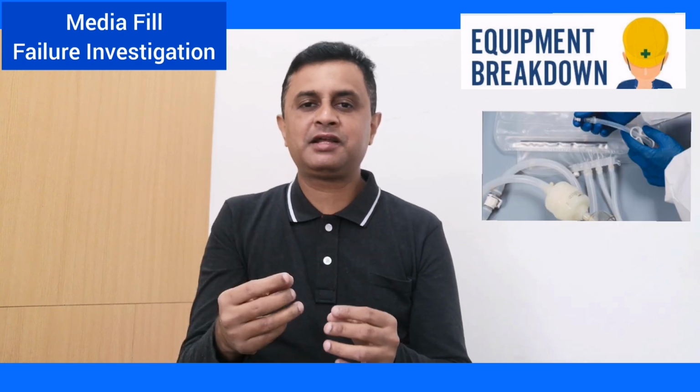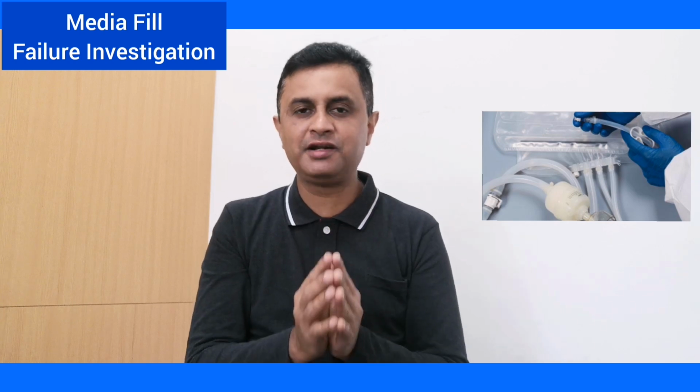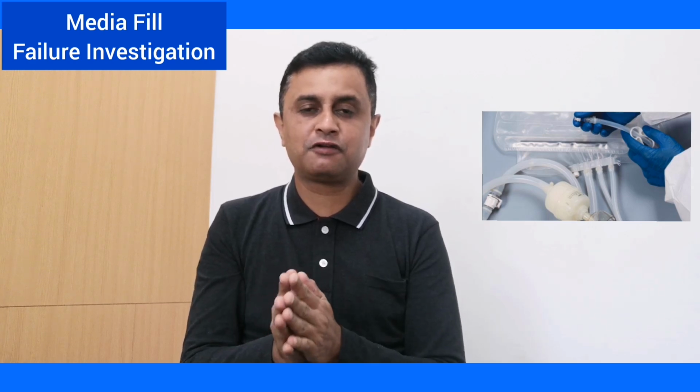These might not have affected the whole batch, but at some point they could have contributed. So we have to go into the depth of things. If the obvious correlatable cause is not identified, then we have to go deeper.